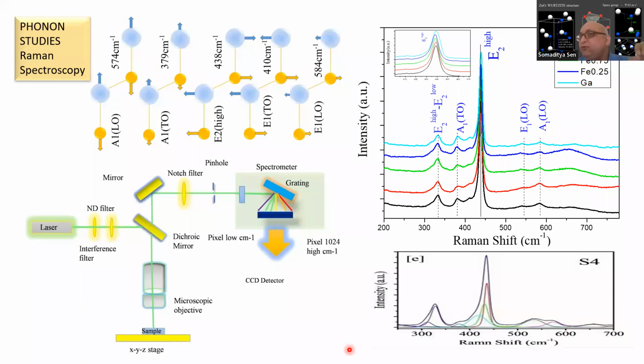You have to do a Raman spectrum of that thing, and then go to the object that you are investigating and find whether that same signal is present in it. And then how much is the quantity of which component, as there will be several components, maybe one or two other things from the person who has done the crime. So those components have to be separated out, and then you have to get to a result.